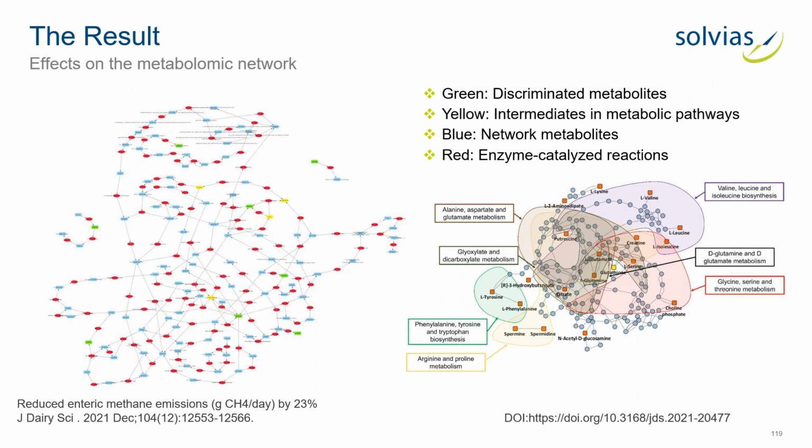Hopefully, there is, for example, KEGG, which has a huge database of all the metabolites and can link them with direction into a beautiful network. This, for example, is one of the networks that we get. You see some spots colored in green, which are the metabolites that we identified as discriminating. There are others in yellow, which are intermediates, not really the metabolite itself, but in a transition state to become another metabolite. You have the reaction nodes, and you know which enzymes are in each reaction. We highlighted here only the ones linked to our target.